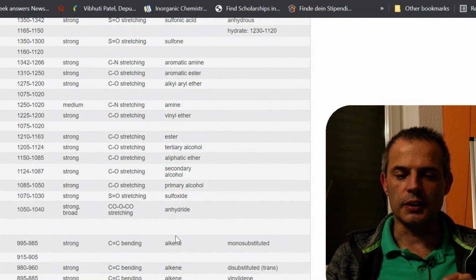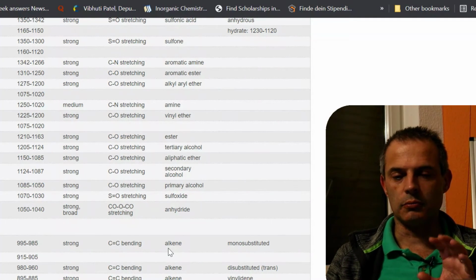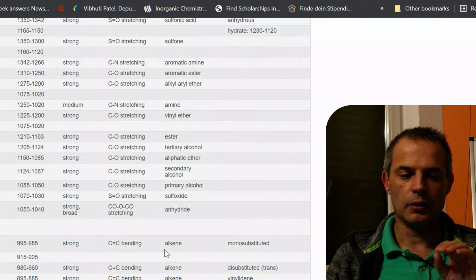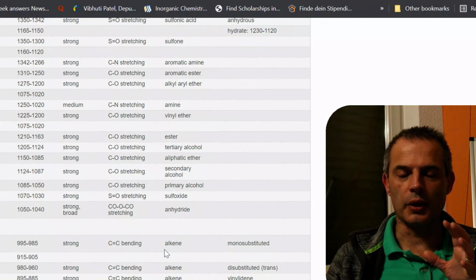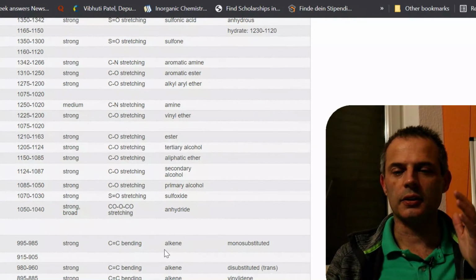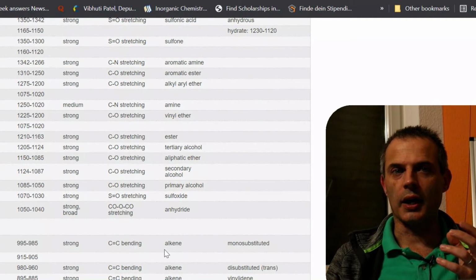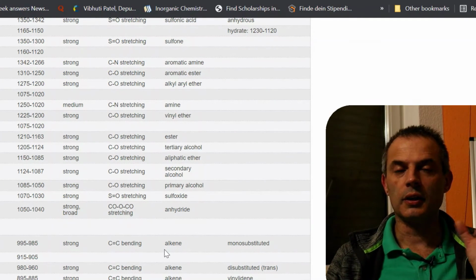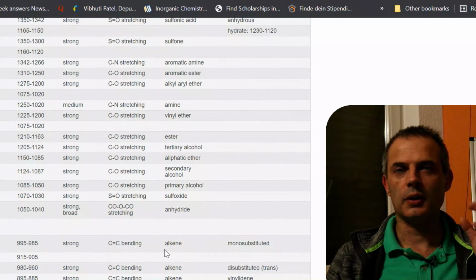As we go further and further down, we'll run into problems, but most spectrometers don't measure below 400 or 800 wave numbers, because there will be some kind of window in there, either a window to the detector or a crystal for the ATR, or a beam splitter or some kind of coating inside the machine, and depending on what those coatings are made from, they will block the infrared at some point.